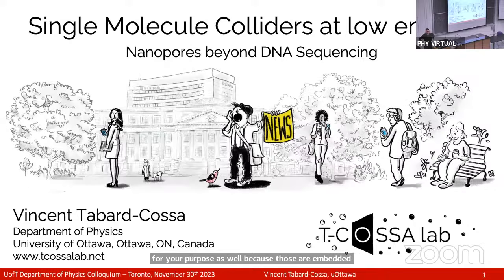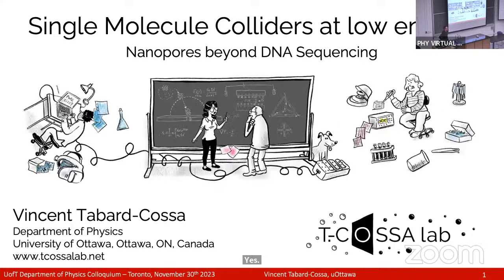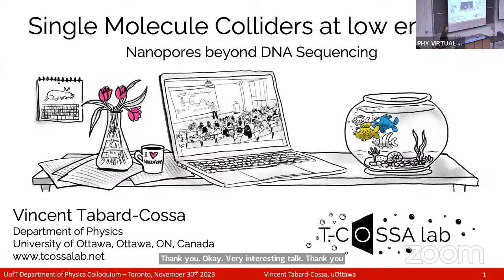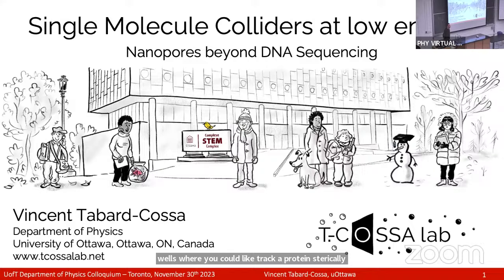Okay. Very interesting talk. Thank you. I was wondering if people have tried to make nanowells where you could trap a protein sterically or mechanically, so that you don't have to rely on having it at a dipole moment to trap it.